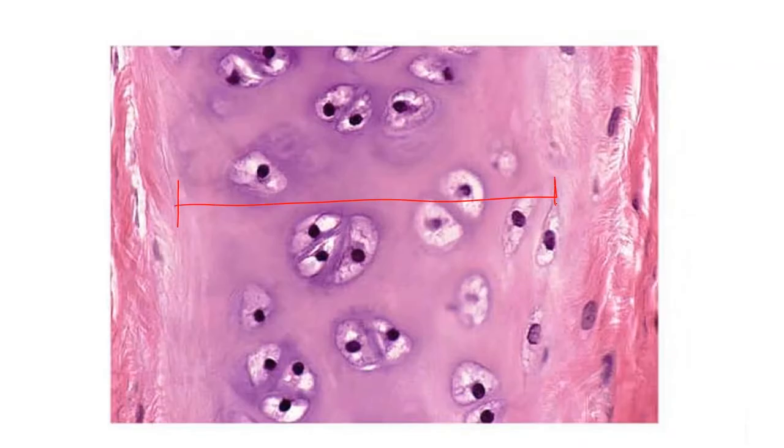From here to here. What do you see? I see eyes in the jungle. And if I see eyes in the jungle, I know I'm looking at little chondrocytes inside of their swimming pools called lacunae. So I know I'm looking at cartilage. But what kind of cartilage is this? There's three types. This is the smooth, glassy matrix, right? No cracks, no bumps, no fuss, no fibers in the matrix. This is hyaline. Hyaline cartilage literally means the glass-like, stained glass window look to me. Where would I find this? Well, the embryonic skeleton, some of the joint cartilages, and other support cartilages. And that's its function, is support.